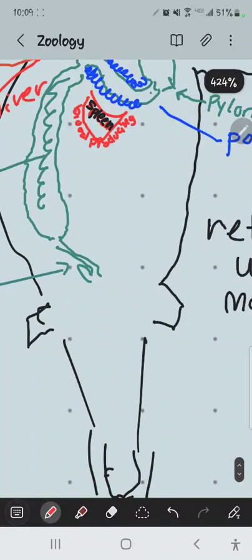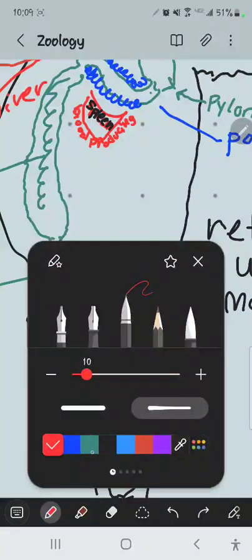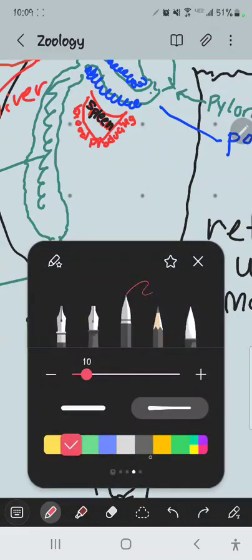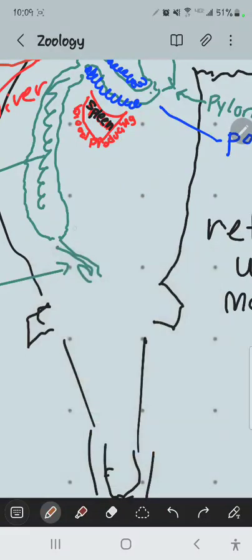The kidneys are a glandular material embedded in the back body wall. If you've ever gone fishing and cleaned the fish, you pull the guts out and then you run your thumb up the backbone of the fish, pushing out those brown glands or brown spongy structures beside the backbone. You're basically scraping out the kidneys of the fish.